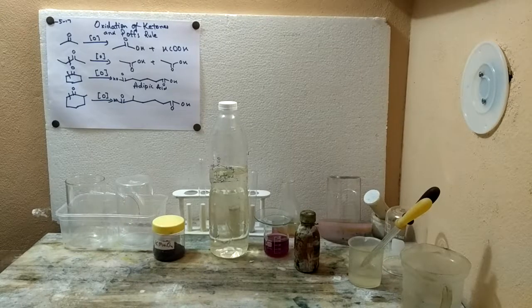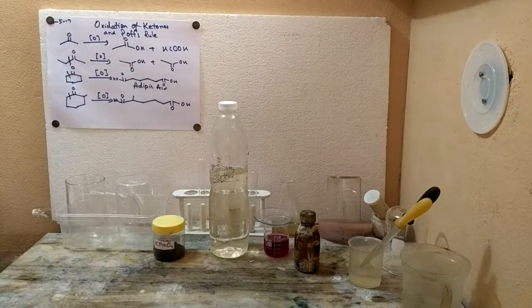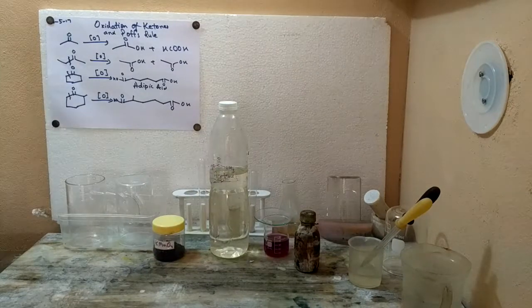In this video, I would be oxidizing some acetone using some potassium permanganate. To oxidize ketones, you need very strong oxidizing agents, that too at elevated temperatures. You can't use mild oxidizing agents like Tollens reagent or Benedict's reagent to oxidize ketones. You absolutely require very strong oxidizing agents like potassium permanganate to carry out this reaction.